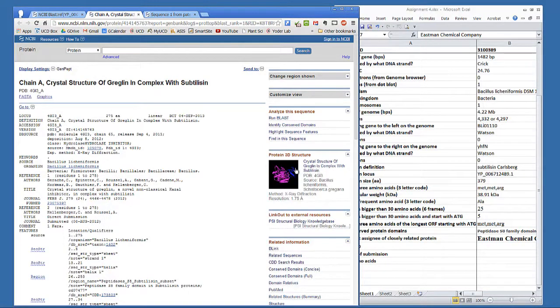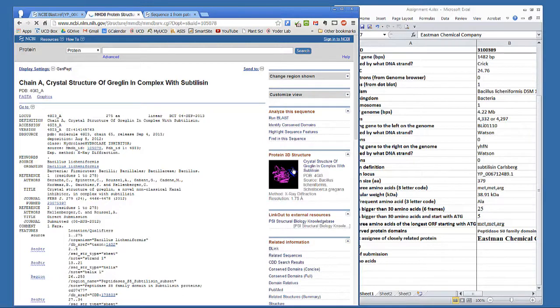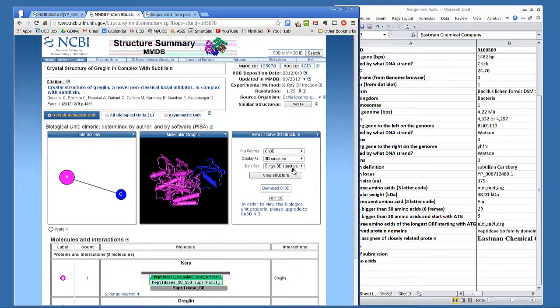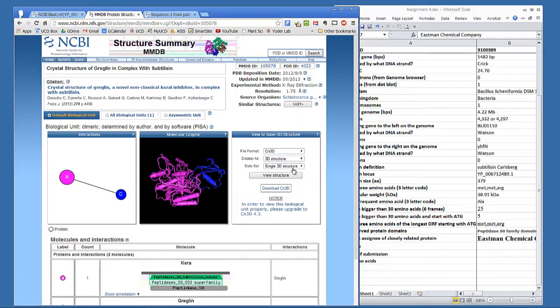Click on the protein 3D structure, and this takes you to the structural summary MMDB page. This is a 3D picture structure of two proteins, the subtilicin in pink-red, and the inhibitor Greiglin, which is in blue. These two proteins interact.